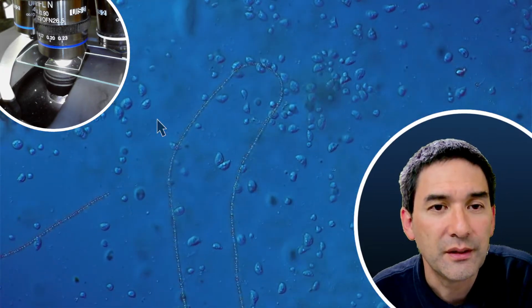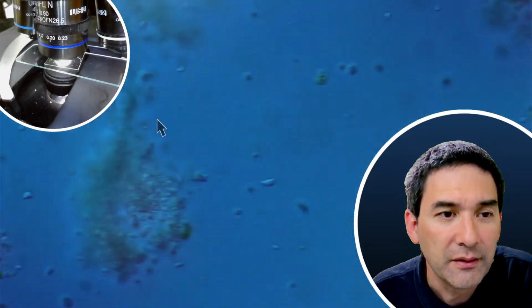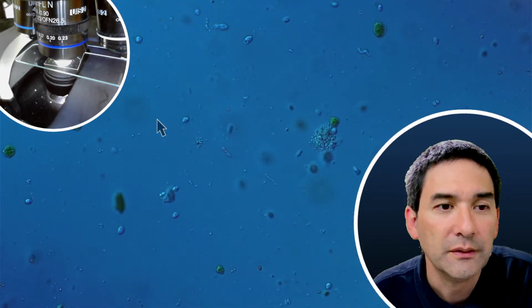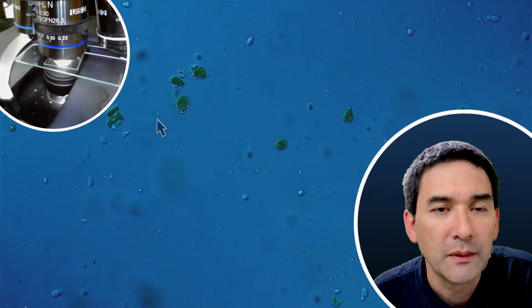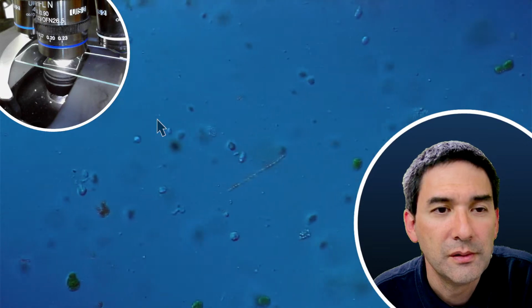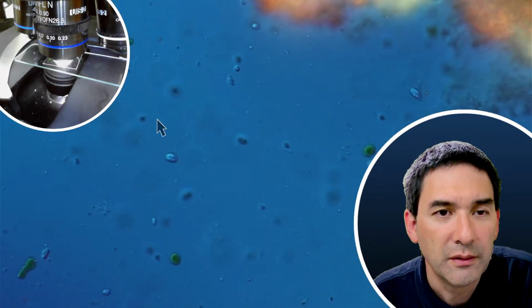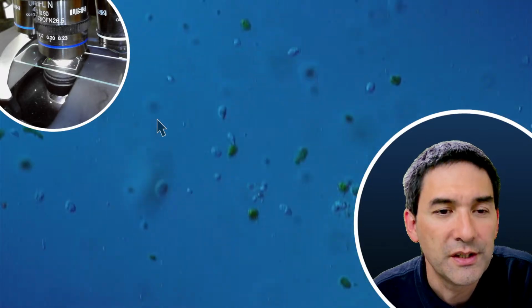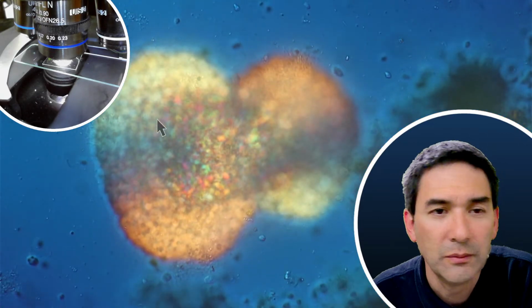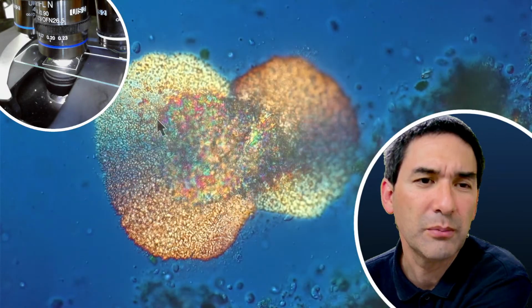So the concentration here is, I would say, almost unnaturally high. Obviously, because I'm decomposing the material, right? These are essentially marine species here because it's from a marine water sample. What is this here? I don't know. Almost all of it looks like, I know it's not a pollen grain.